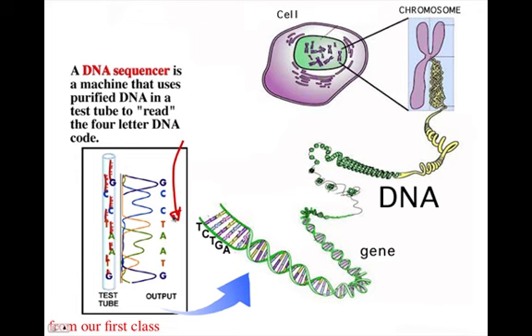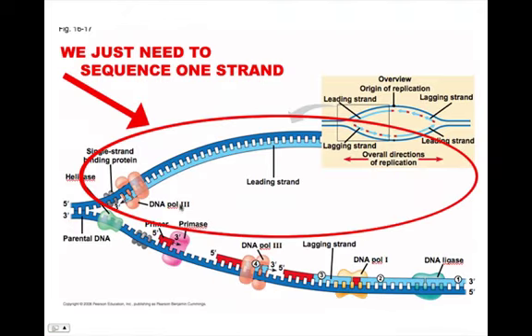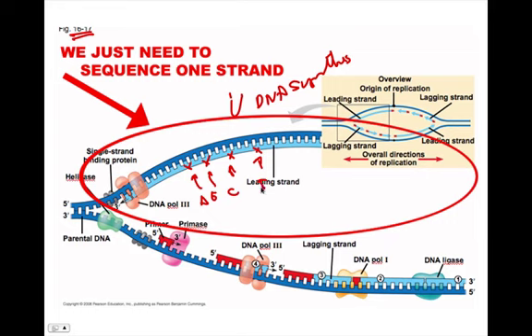This figure in chapter 20 takes advantage of this DNA replication that we just learned about in chapter 16. A reaction is set up in the instrument in test tubes to allow DNA synthesis to occur in the test tube. As the DNA is being synthesized, the strands are getting tagged by fluorescent tags that will allow us to read the sequence, because each of the 4 letters has a unique colored tag with it.